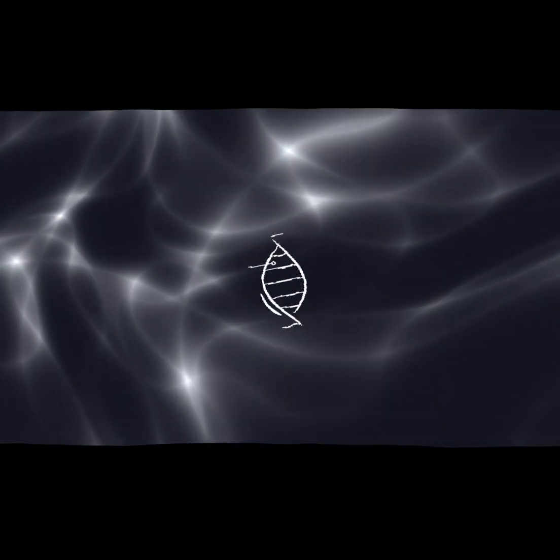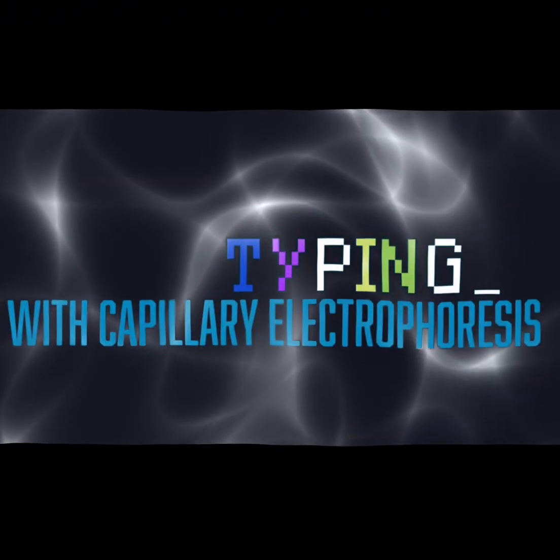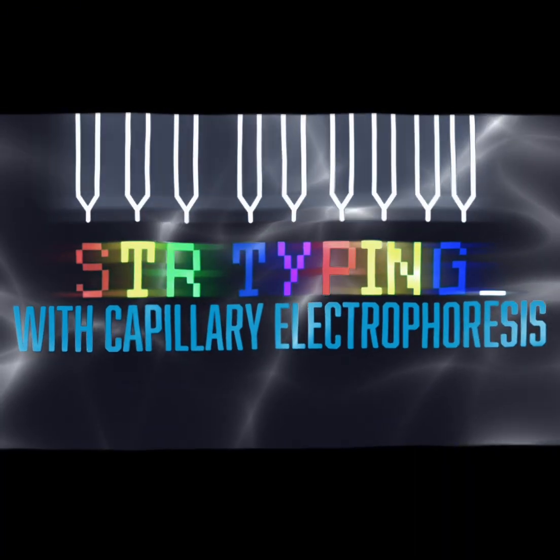Capillary electrophoresis, or CE, is used for STR typing to separate negatively charged DNA by size using electrophoretic properties. DNA fragments amplified by PCR move through a capillary toward the positively charged anode. CE also separates DNA based on fluorescent dyes incorporated during amplification.